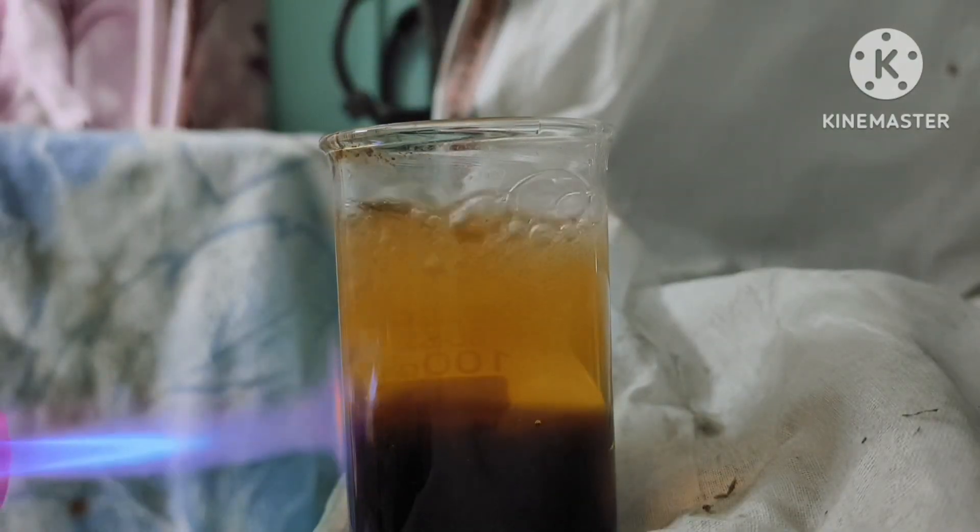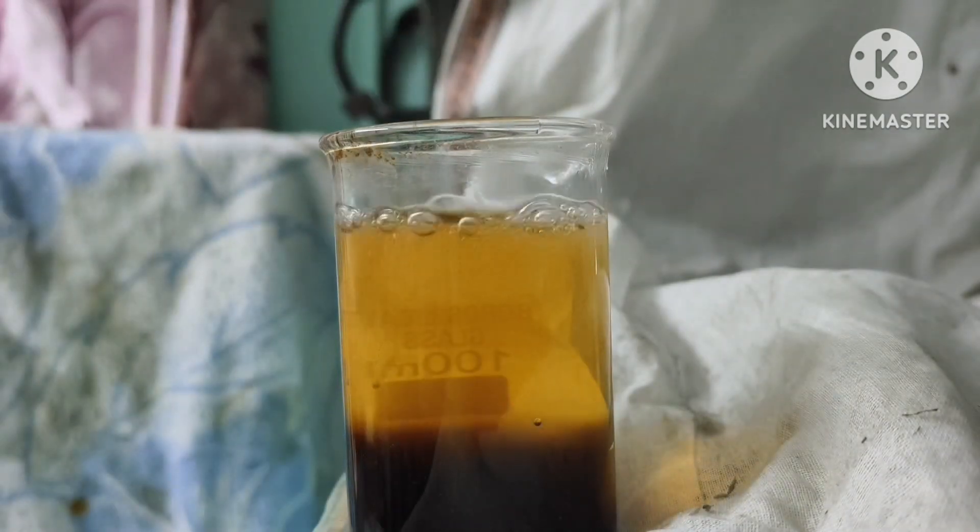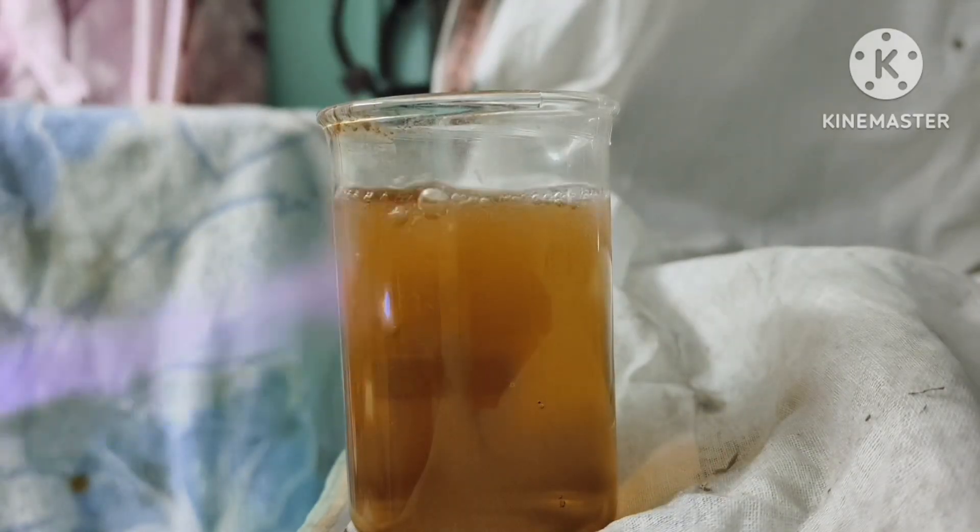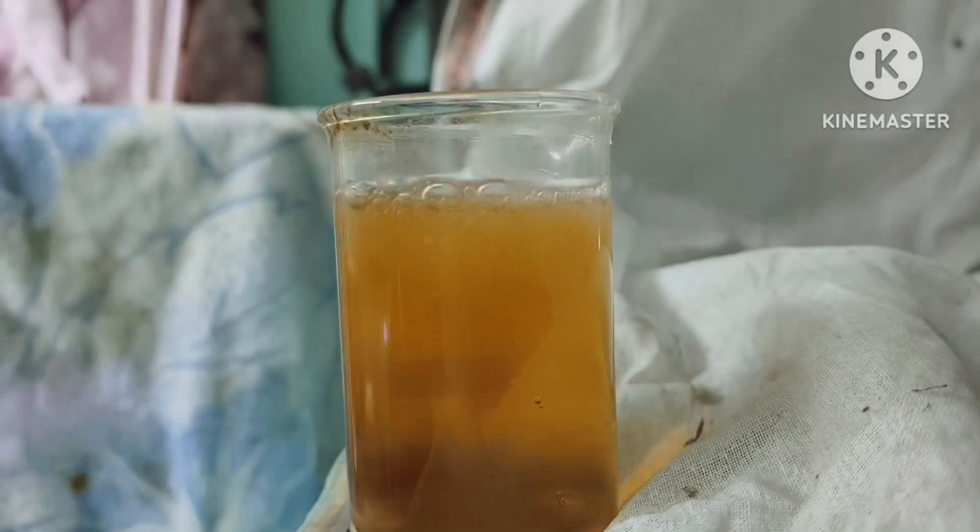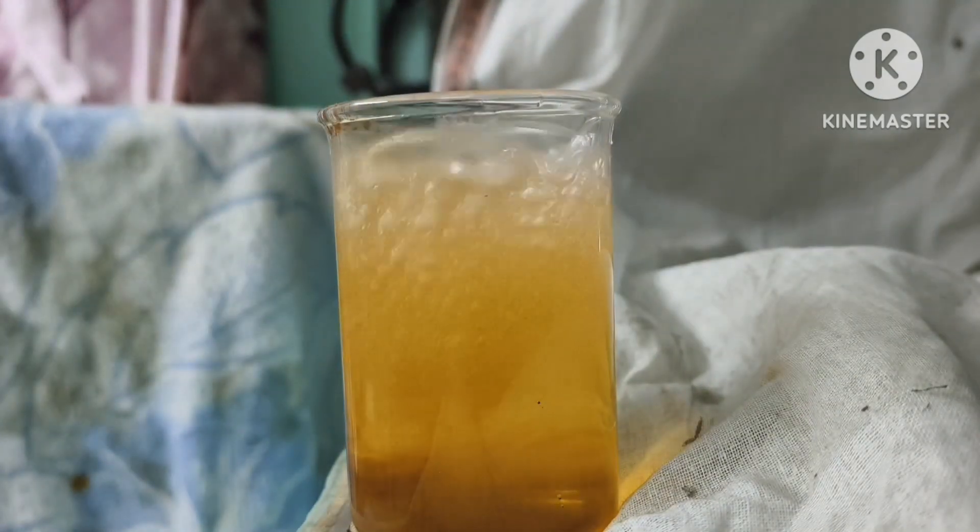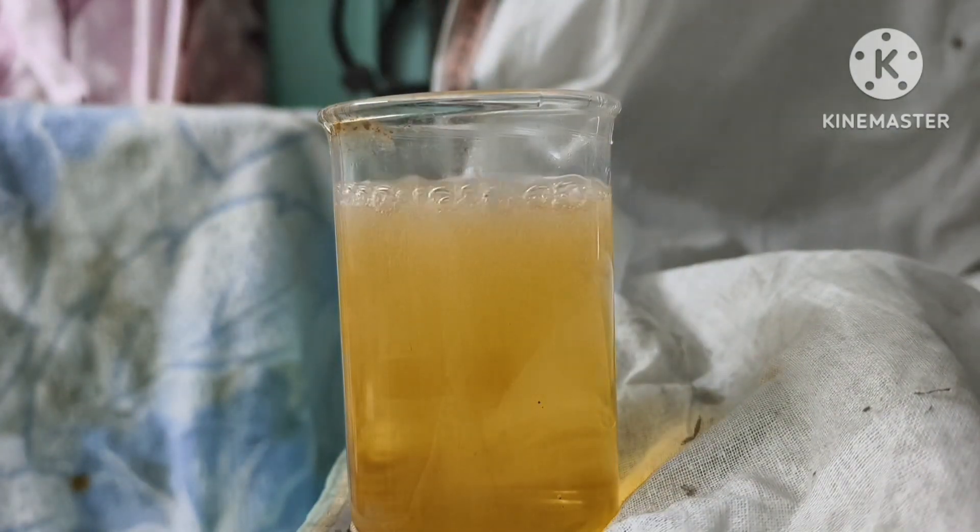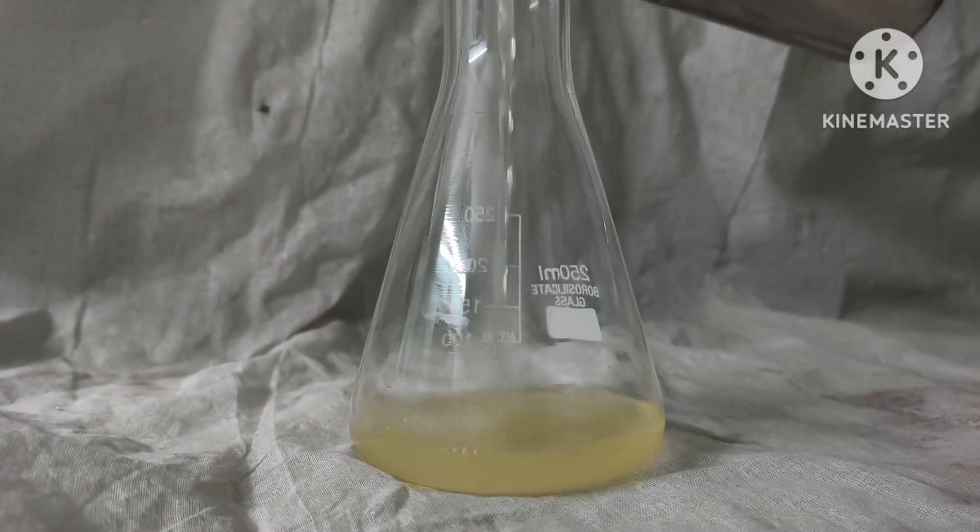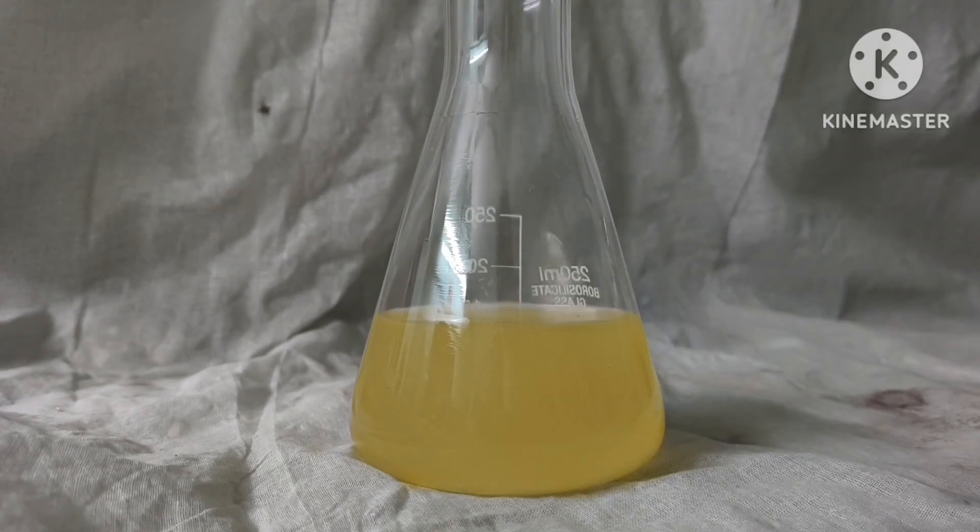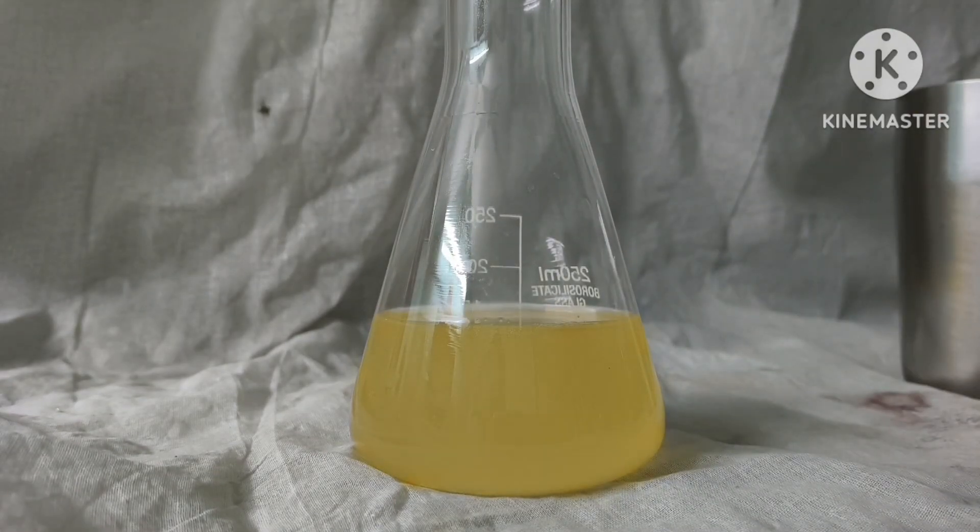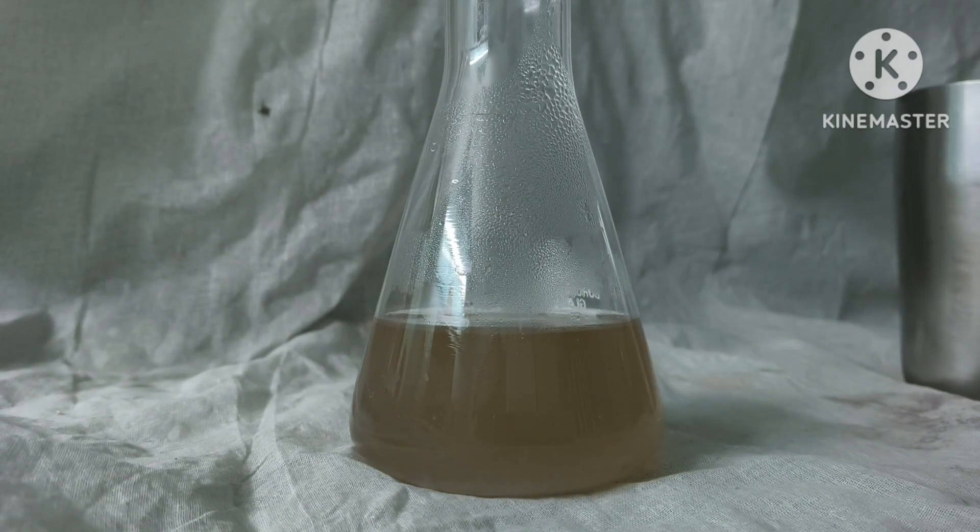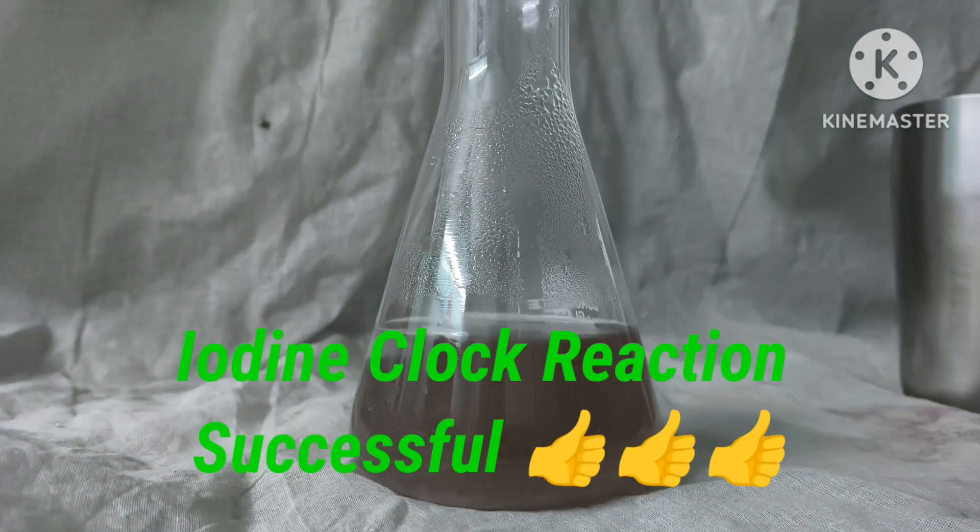As you can see, the solution is boiling and the dark color is starting to fade. I am carefully pouring the solution in a conical flask and letting it cool down. As the solution cools down, the color changes again to deep blue color, and that is why the reaction is called the iodine clock reaction.